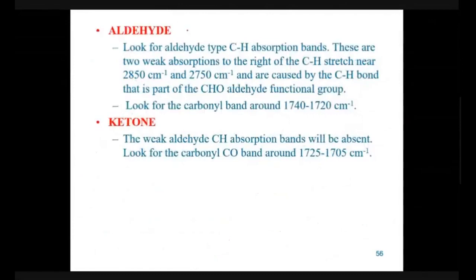Let's move on to aldehydes and ketones. Aldehyde versus ketone. Can you tell me which bond is distinguishing between these two? CH bond. Very good. Very good. Very good, Mahipal Pureval. The CH bond is distinguishing. So it has to be that the carbonyl carbon has an aldehydic hydrogen bond, which is characteristic for aldehyde and will not be present for ketone. So look for an aldehyde type CH absorption band. Now they have specified aldehyde type. They have not simply stated CH bond.